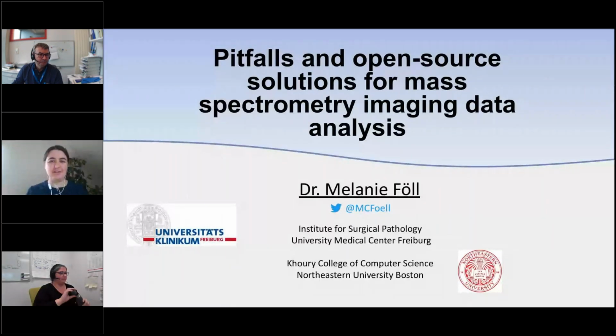One part is the use of mass spectrometry imaging to analyze tumor samples, and the other is to make mass spectrometry imaging more standardized in terms of wet lab, but also computation. And here I'm talking about my postdoc work in the Vitek lab, as well as some of the software things we did in Freiburg.